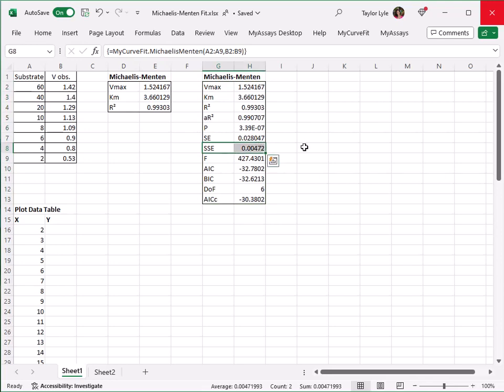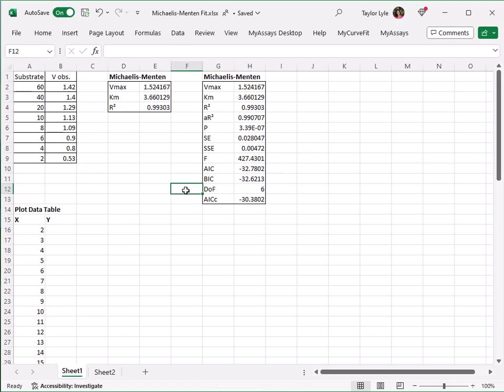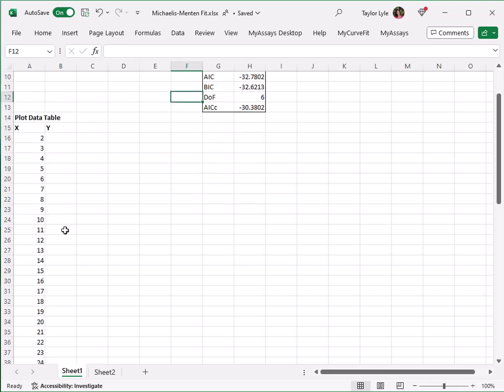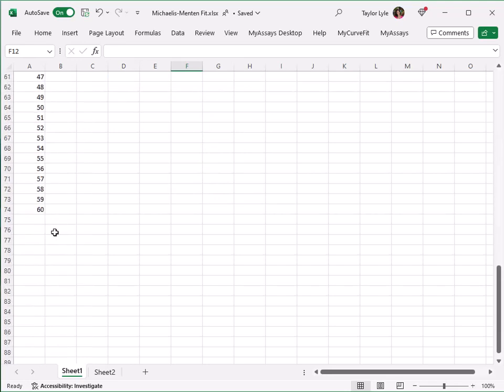We can also plot the curve by creating a plot data table and a corresponding scatter chart. I'll create the plot data table directly below the calculated parameters. The X values should span the range of the calibrator X values or the substrate values. My table includes values from 2 to 60.